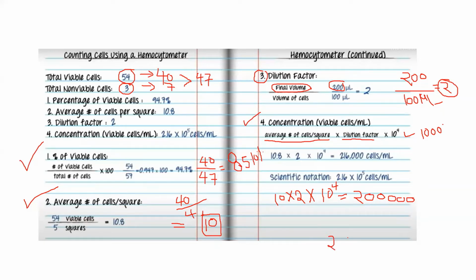So you can write it scientifically as 2.0 multiplied by 10 to the power 5 cells per milliliter. Isn't it simple? It looks a little complicated, but it's very simple. You just need the first number of your cells. That's it. After that, the calculation can be done very easily. Are we okay till here?